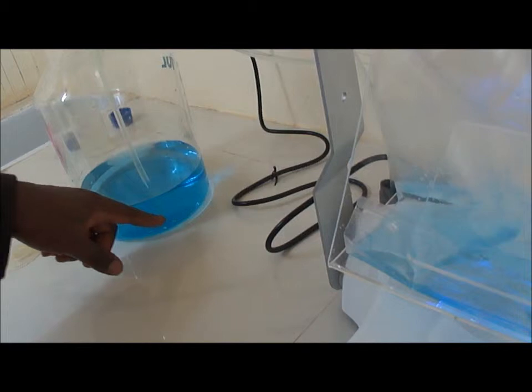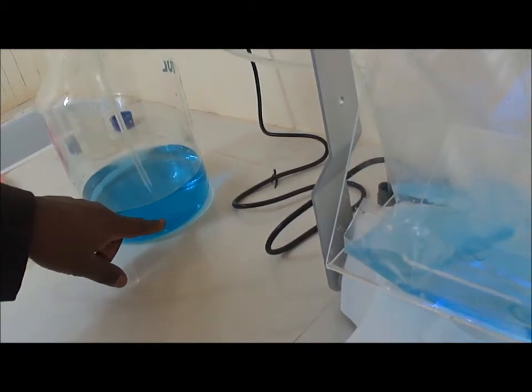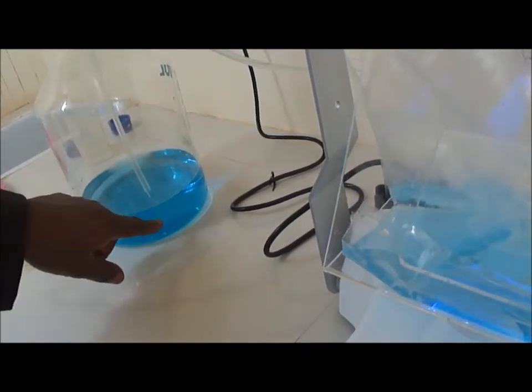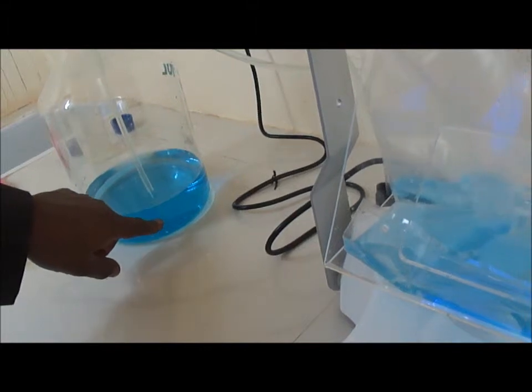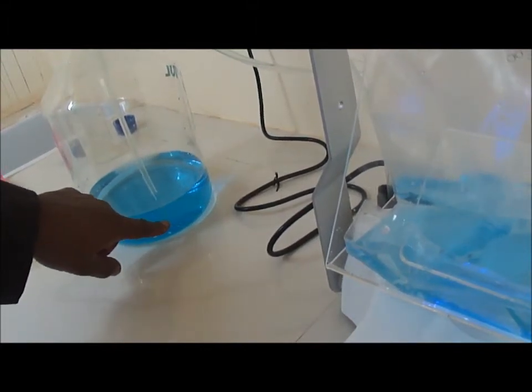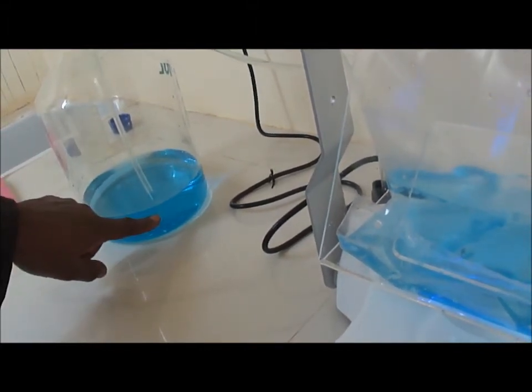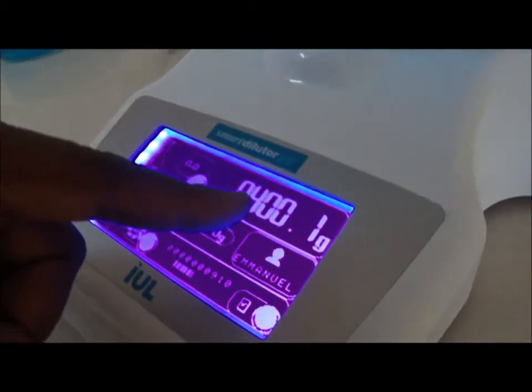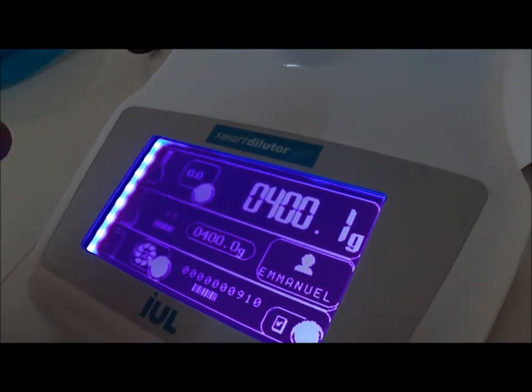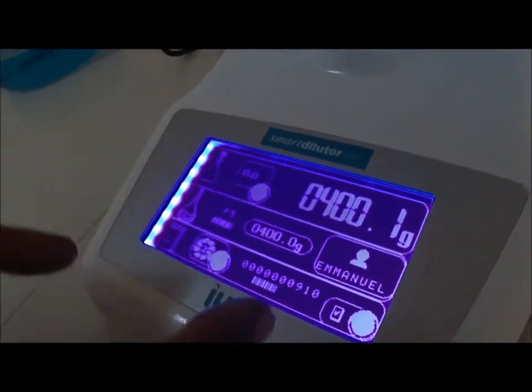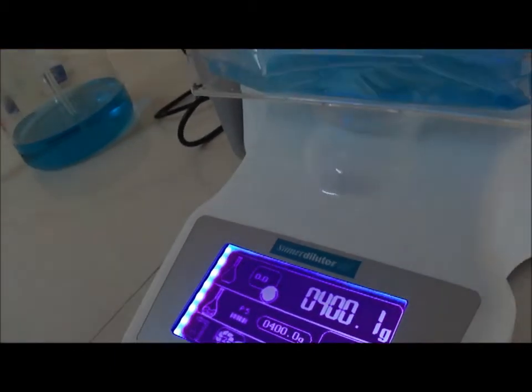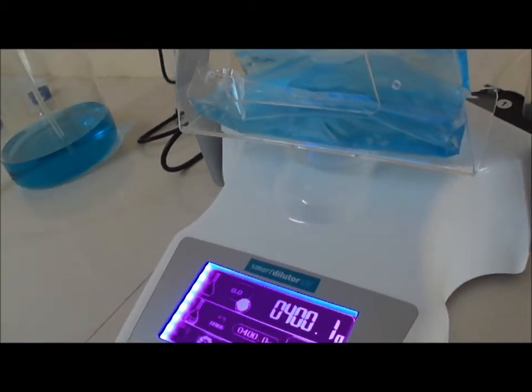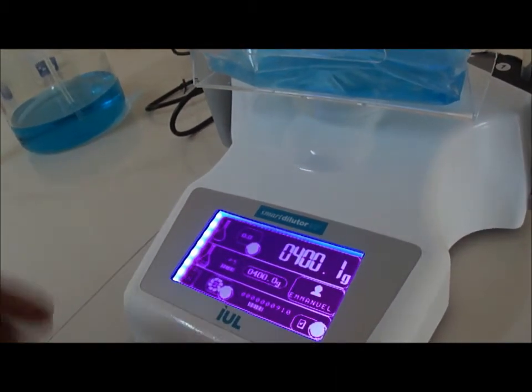And one should be careful that the extremity of the pipe is always under the solution. And then finally you see the final weight of both the mixing of my sample and my solution is 400 grams. So in this example, we have made the dispensing.